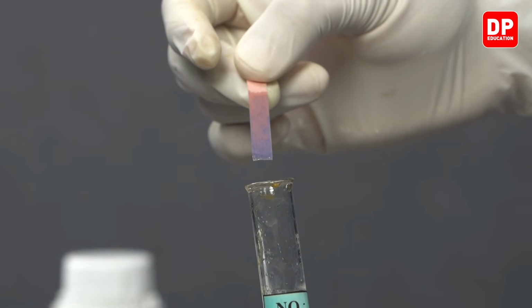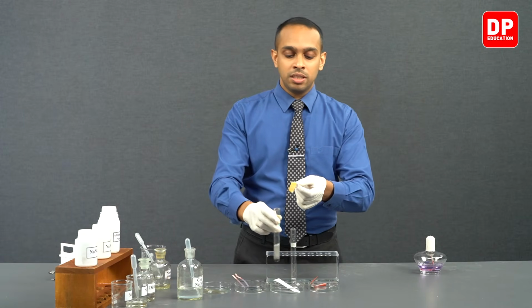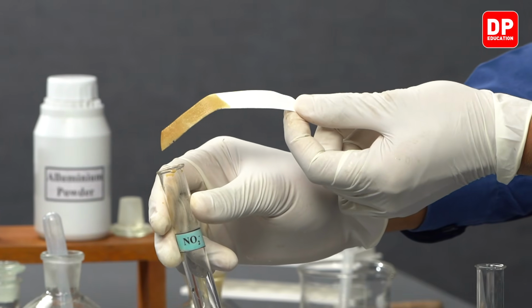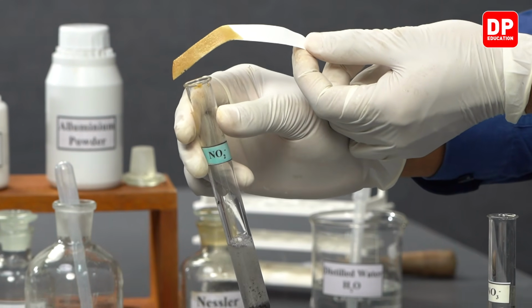This indicates the gas that is produced is basic, and the Nessler's reagent turning brown indicated that the gas that is produced is ammonia.